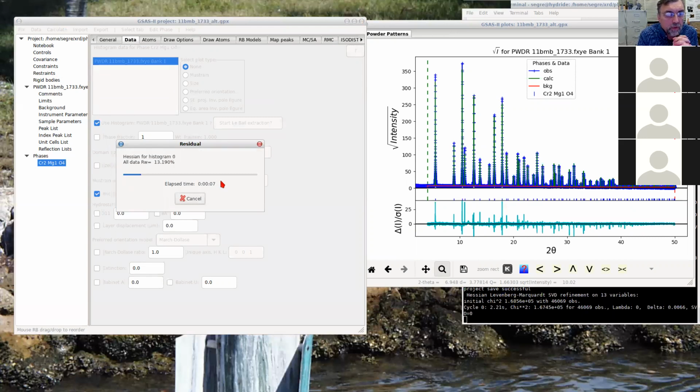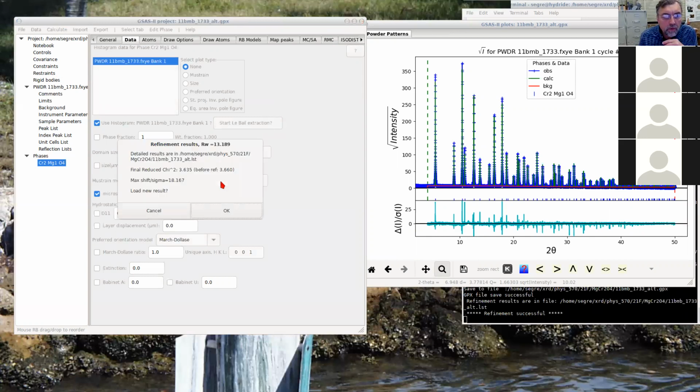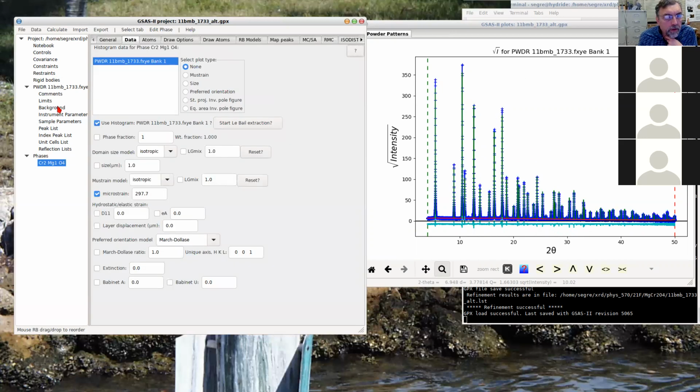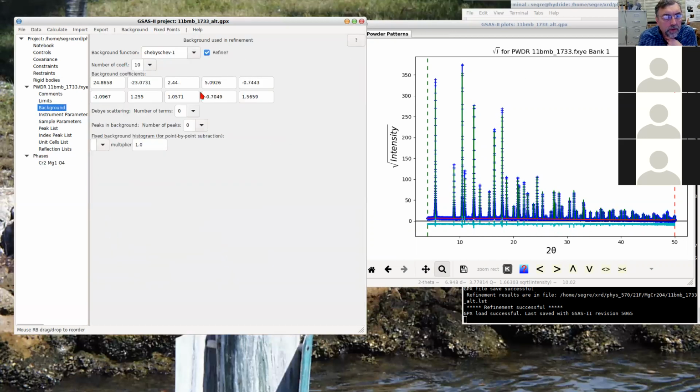Yeah, this is more stable. For some reason I was in a funny mode. So this one more background parameter doesn't make much difference. Let's go to 12. And that's usually as much as I ever go. And it may be too much. We'll see.